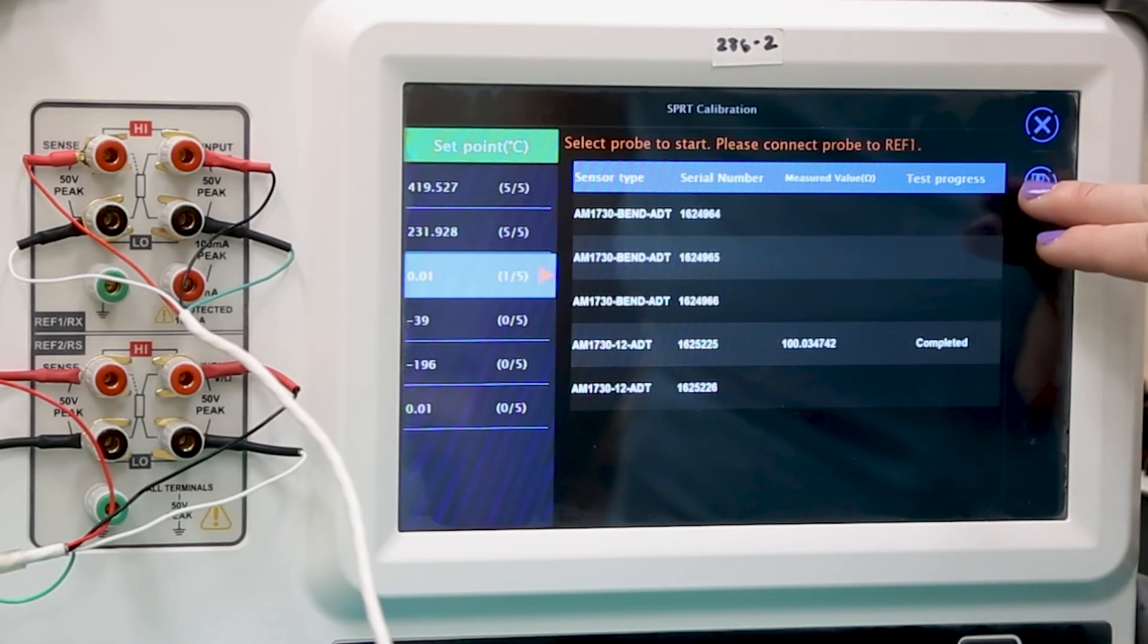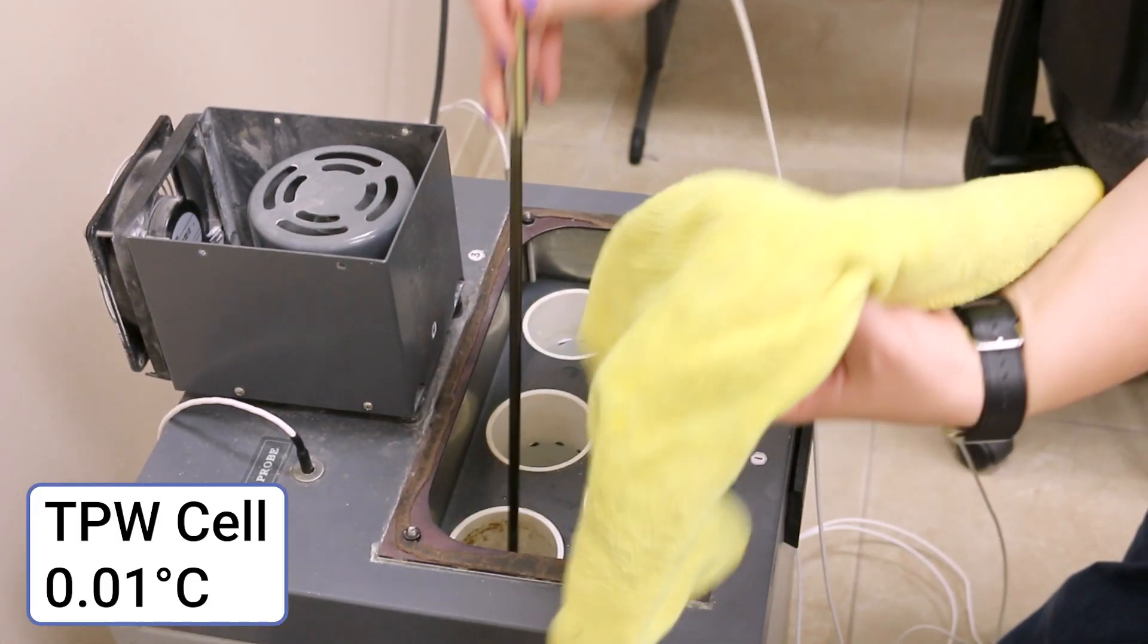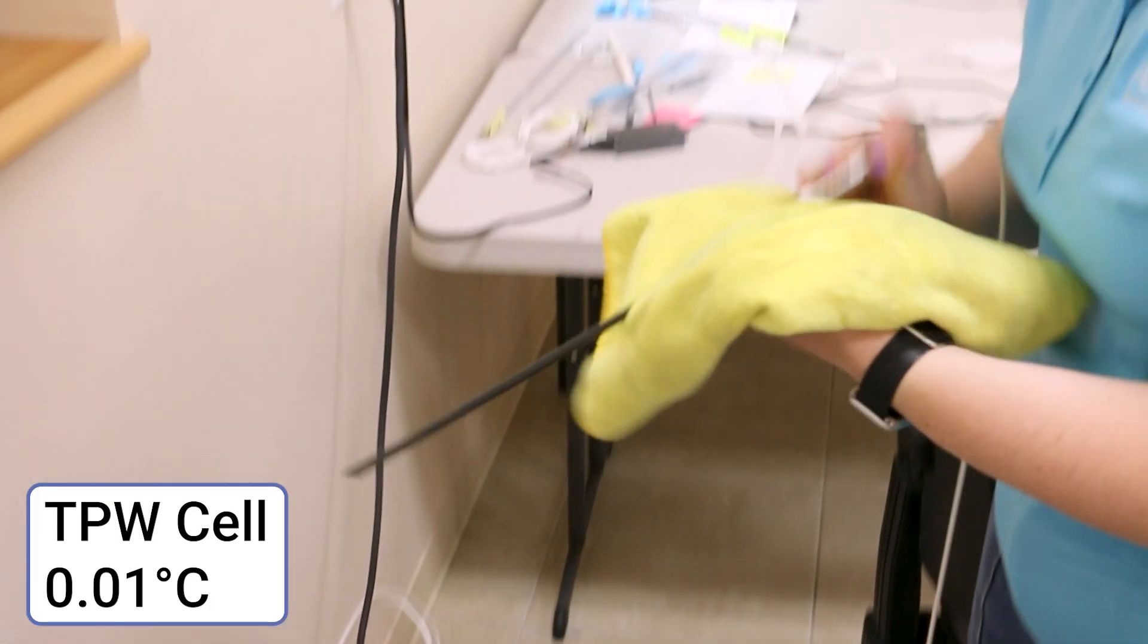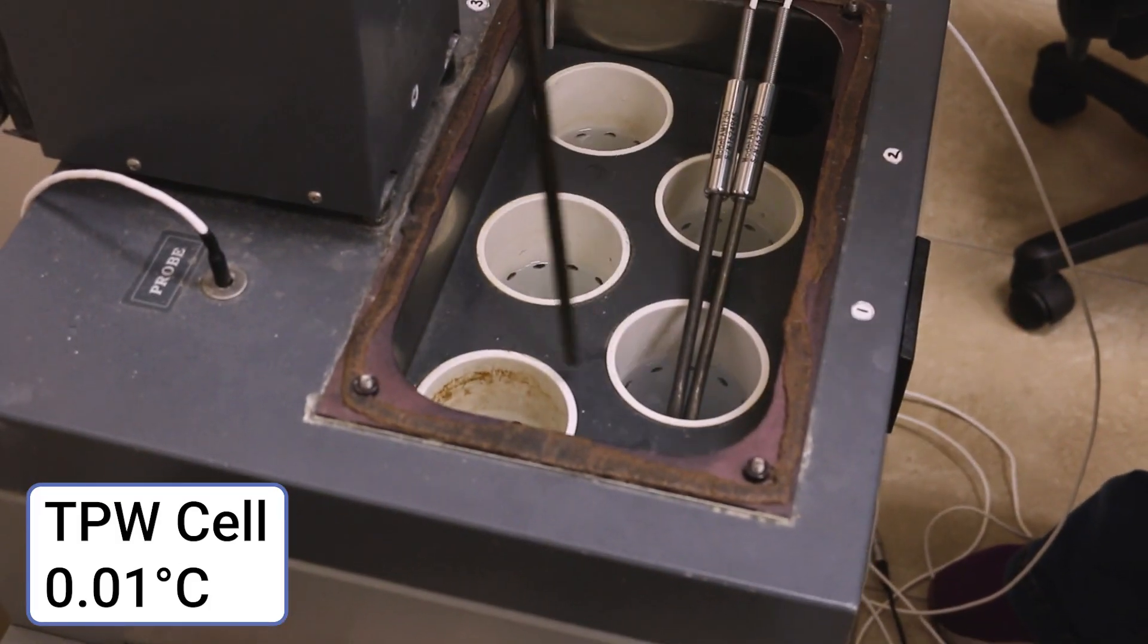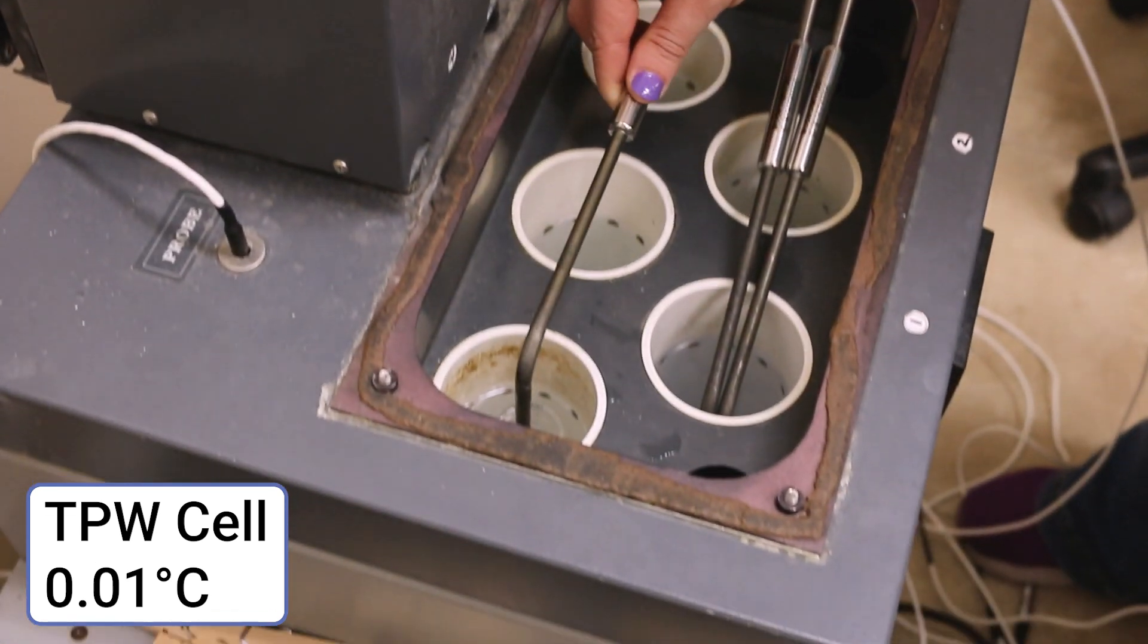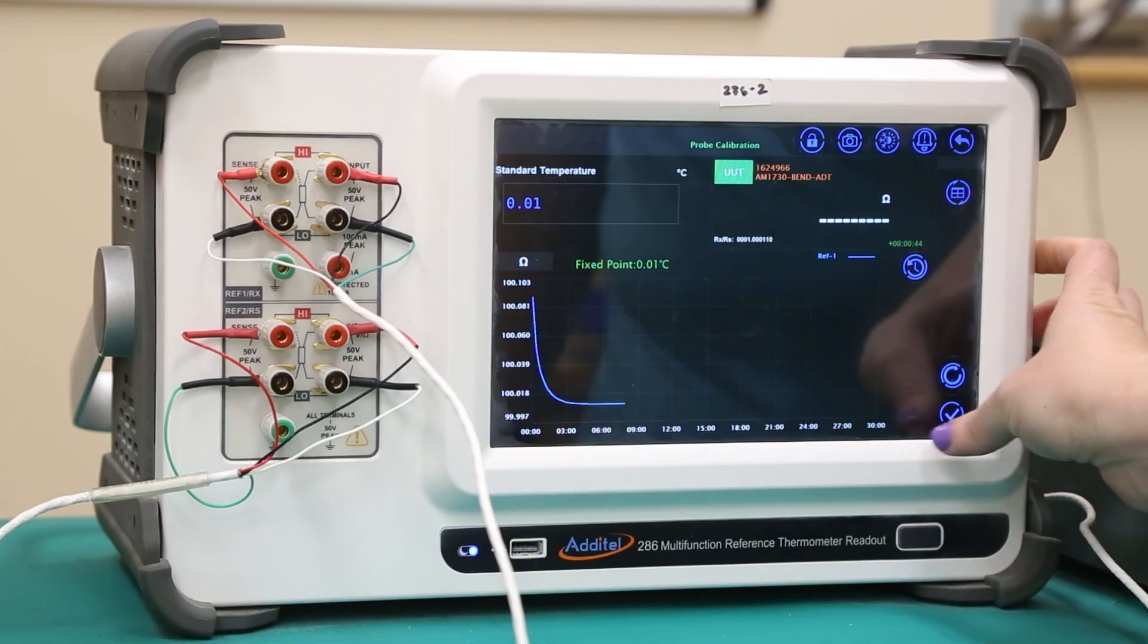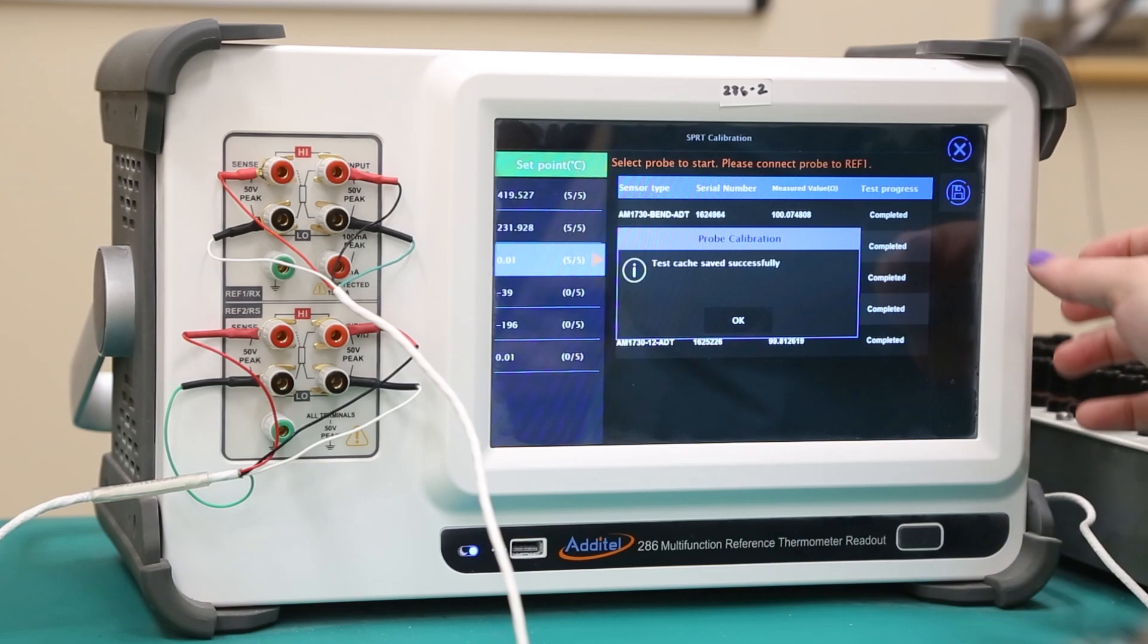After the probe has been measured, save the test cache, remove the probe from the cell, and dry it off. Swap the connection to the next probe to be measured, add it to the triple point cell, and repeat the process to complete the measurement. After all probes have been measured at the triple point of water, we will move to the triple point of mercury.